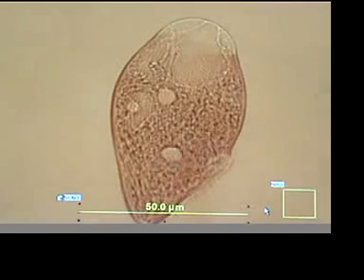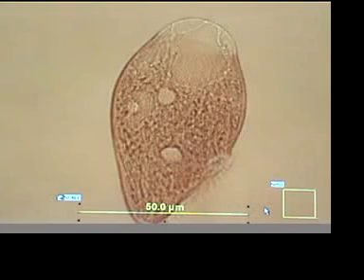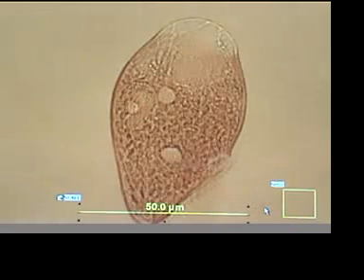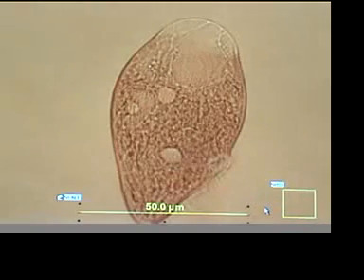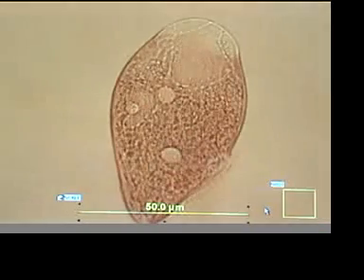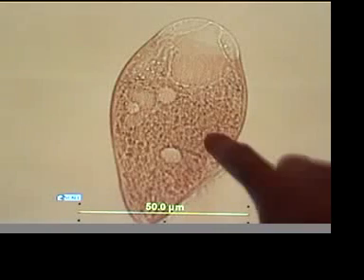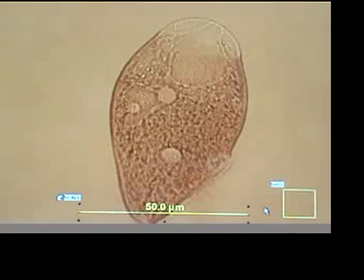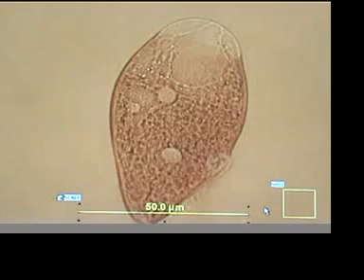I'll adjust the focus a little bit and see what we can pick up on the screen. It looks like there's a lot of little spheroids forming within there. There's certainly a number of small spheroids forming where we didn't see that before.